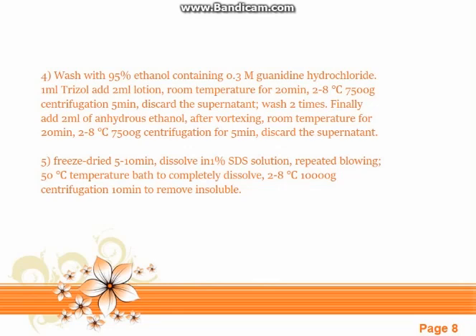5. Freeze-dry for 5-10 minutes, dissolve in 1% SDS solution, with repeated pipetting. Use a 50 degrees Celsius bath to dissolve completely, then centrifuge at 2-8 degrees Celsius, 10,000 grams for 10 minutes to remove insoluble material.